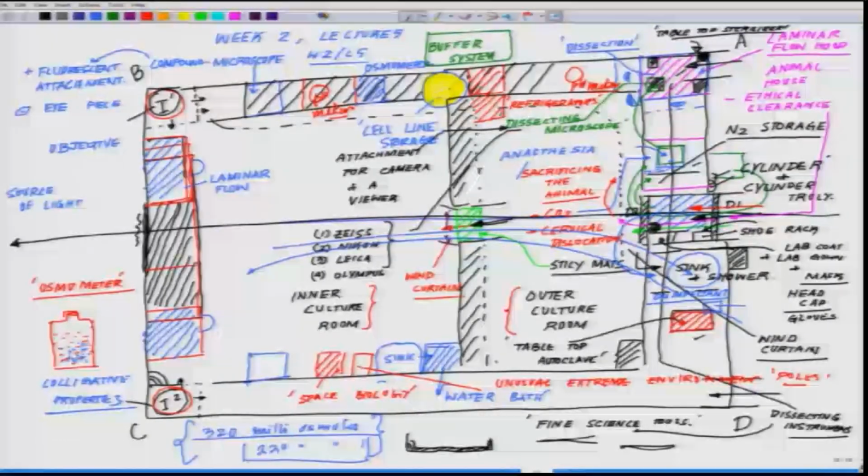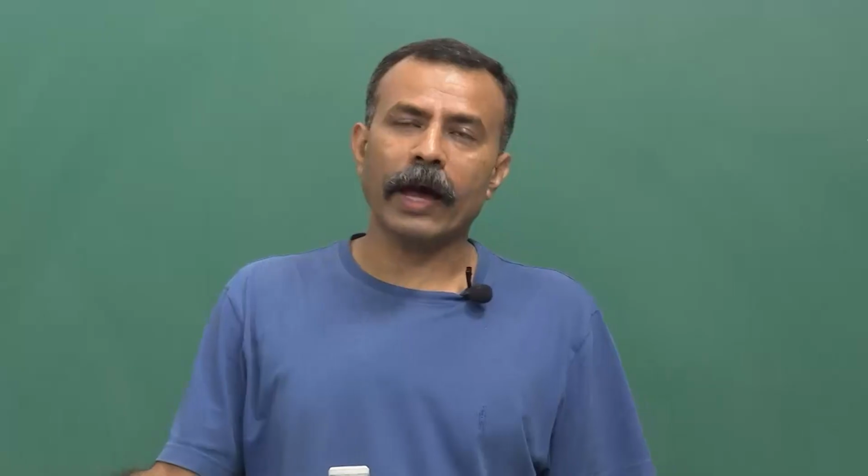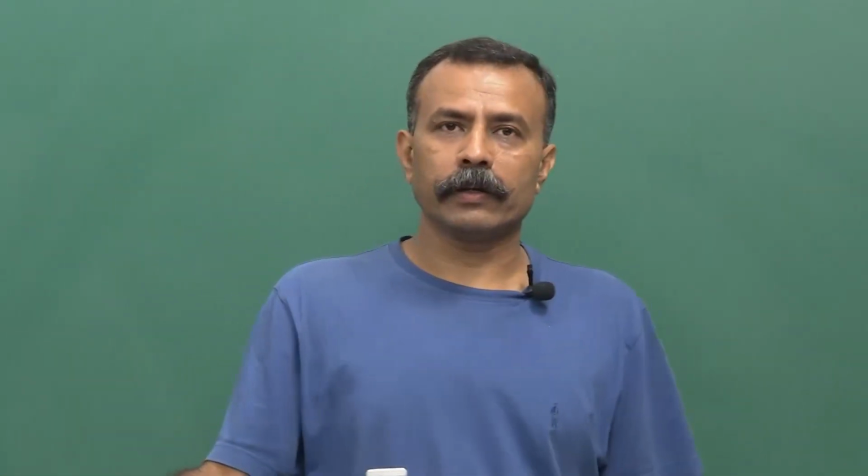You would need incubators of that kind where you can simulate those conditions, and you would need to keep them at separate spots. When you are planning a lab, you do not know what you are going to land up with, but you have to have a provision that if you land up with it, you will be working on it.